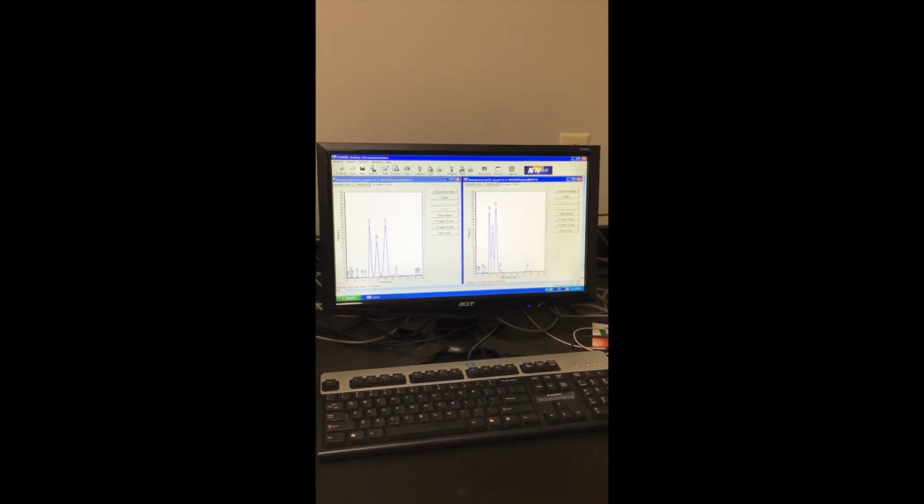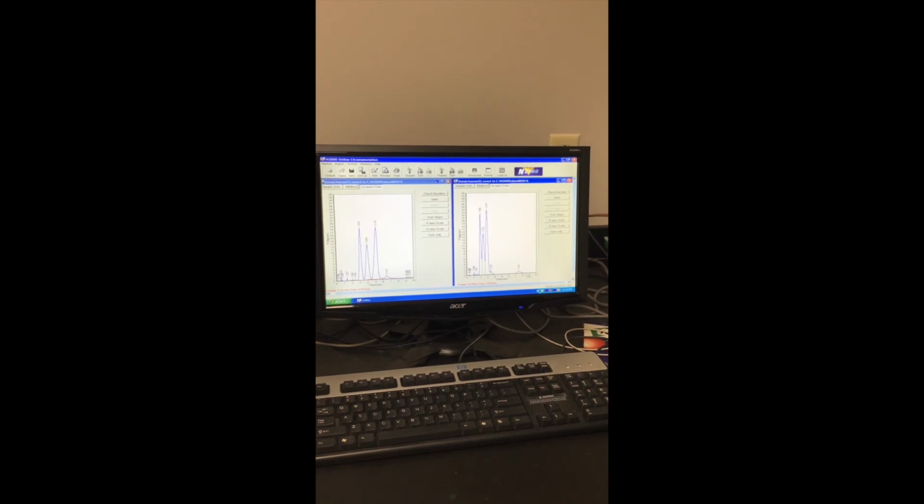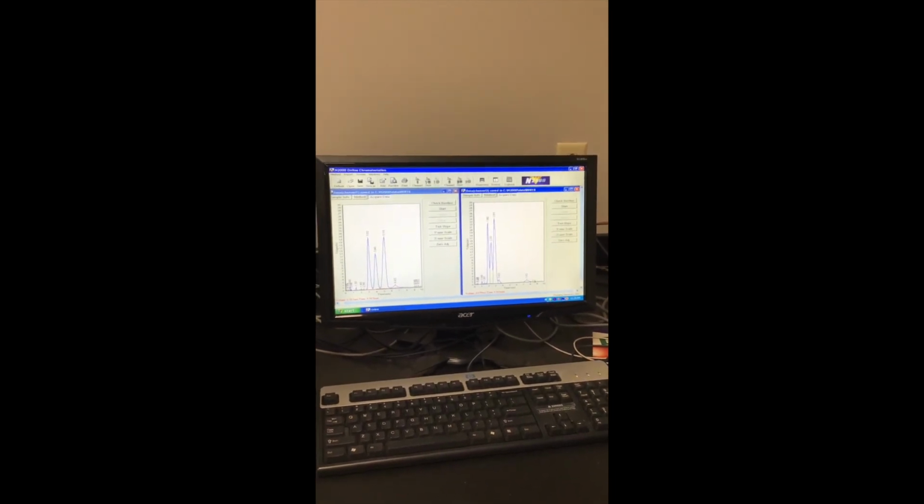In this case, I want to say that this is the mixture. So what we can see here is that the last product that came through was at about 7.5 minutes, and it tapered off by just past 8 minutes. Now, these last 2 minutes over here have no extra information to give to the GC, and so we could have theoretically stopped it right here at 8.25 minutes, 8 minutes, 15 seconds. We could have cut it off and then saved the rest of the time.